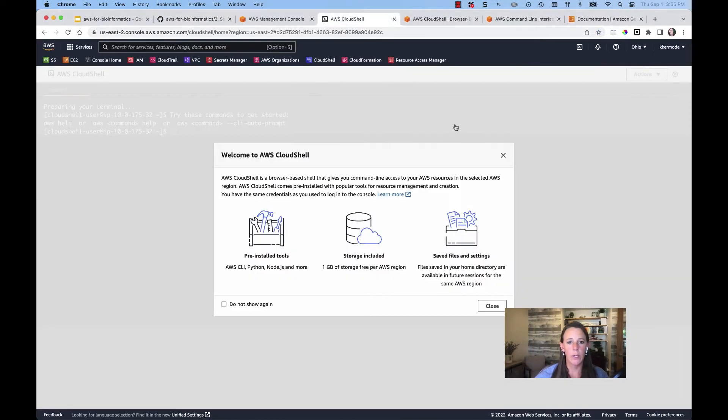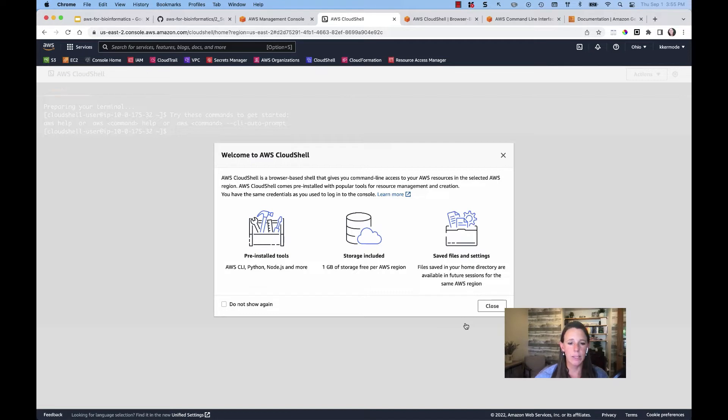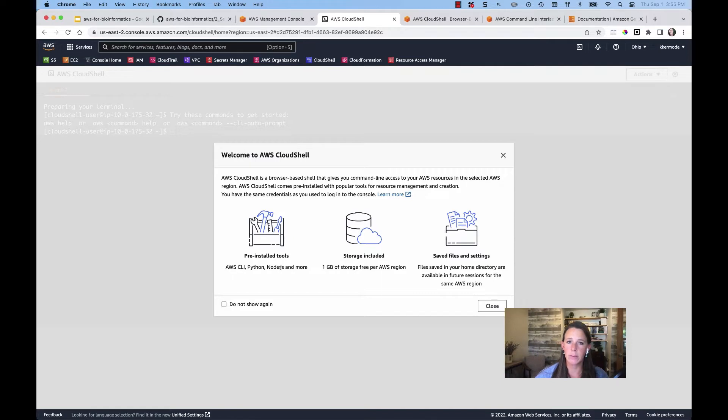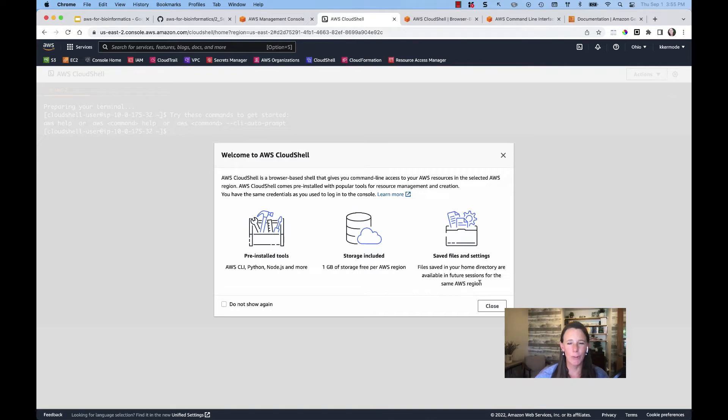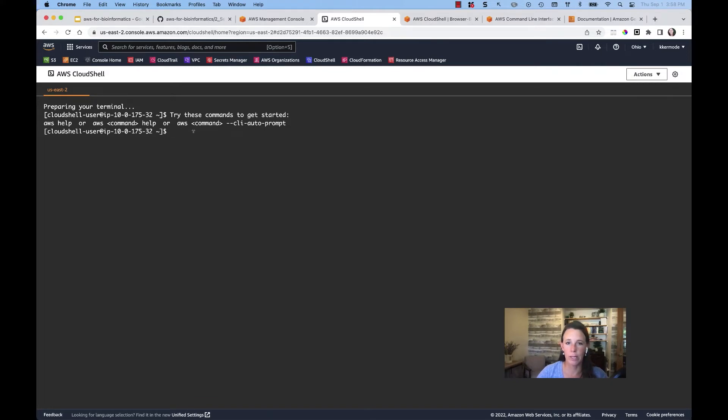So here I've spun up my Cloud Shell. I've hit on the little terminal icon, it's spun up my Cloud Shell instance. You'll see that it's just reminding me that it's come pre-installed with specific tools. The storage is included and I have a home directory of those same files, so I'll hit close. And now you can see that we are in our terminal window within our Cloud Shell instance.